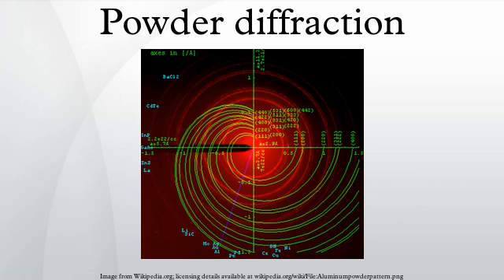The Powder Diffraction File contains many subfiles, such as minerals, metals and alloys, pharmaceuticals, forensics, excipients, superconductors, semiconductors, etc., with large collections of organic, organometallic and inorganic reference materials.